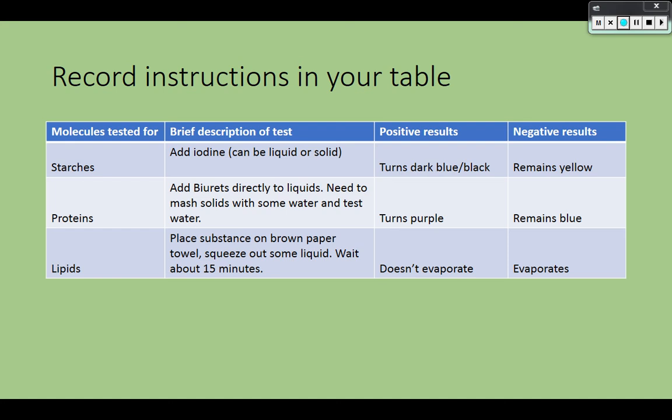So what we're going to do in class, as I said, is I'm going to give you a bunch of foods, and then you're going to determine what foods contain what substances.